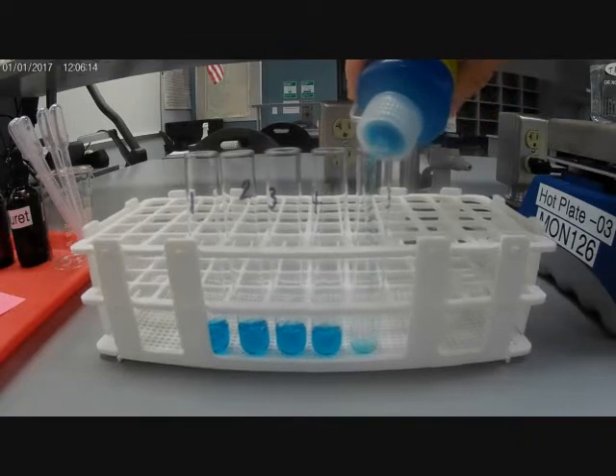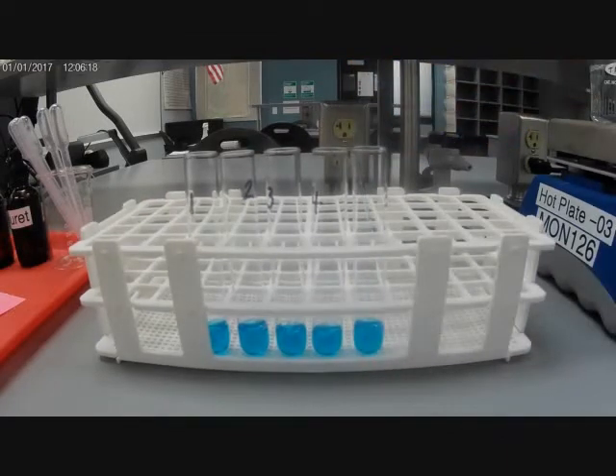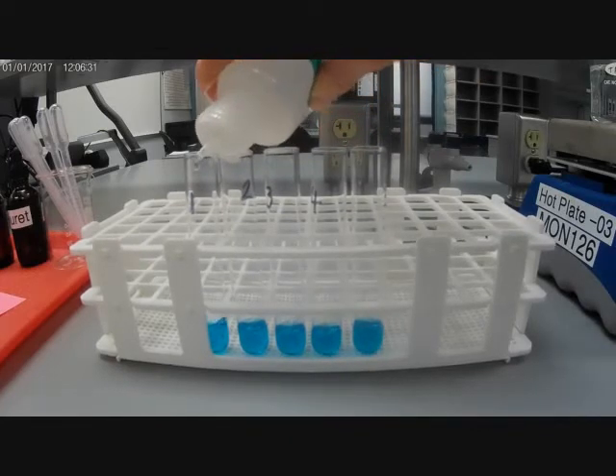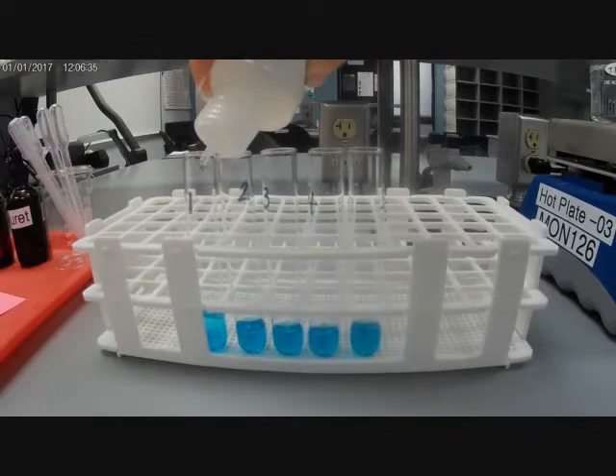There we go. All right, now I'm going to put our test samples into each tube. The first one is going to be just pure water, and I'm going to put an equal amount of water to Benedict's solution into tube number one. So there it goes.